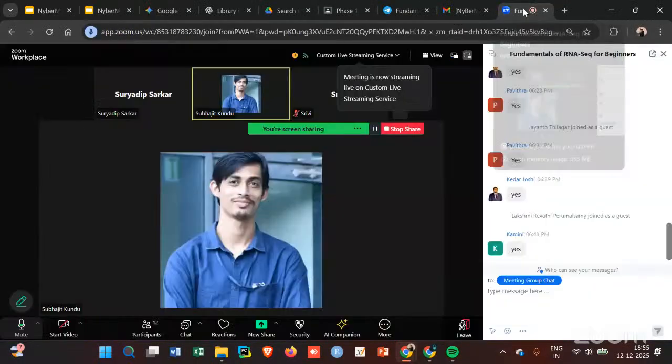Any more questions on normalization? The basic idea of normalization, that is. We will look at the various techniques we use to normalize. This is the technique that I showed you. It is the most crude technique, the simplest of all of them. There are much more complicated techniques to actually perform normalization. We will take a look at them. Don't worry.